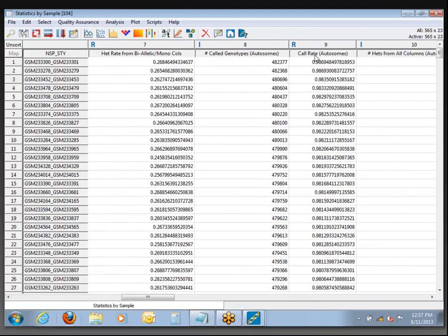Further over, there's a call rate that's exclusive to the autosomes. That's going to be important if you have X and Y chromosome data. This project has just X data. We would expect that males and females would both have calls on X, but Y is only going to be called in males. I've seen situations where you get a bimodal distribution on call rate perfectly correlated with gender because you've got the whole genome data including Y in your call rates.